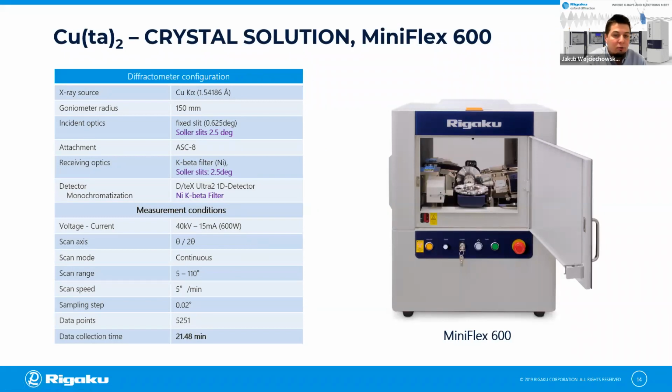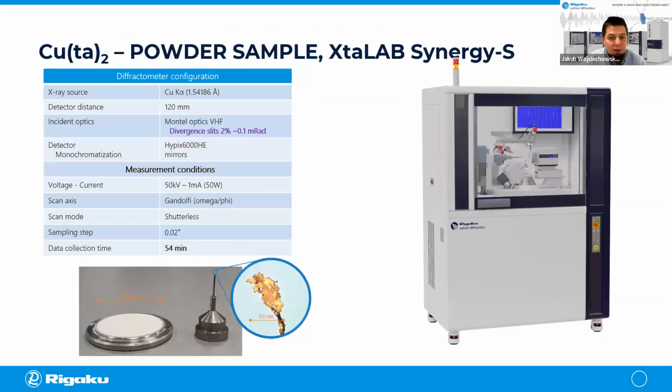I could not really believe it, then Maciej showed me 20 minutes of powder data collection. It's a cool small device, a small circle giving a very short beam path, with the advantages of high intensity and short measurements. With a proper setup of the Soller slits and some nickel filters, you can get enough data quality to actually solve a MOF structure if the sample diffracts well. So I thought, if the MiniFlex can do it, then probably I can do it also on the Synergy.